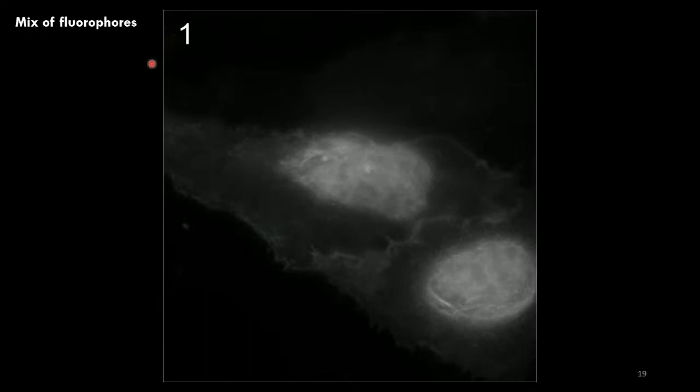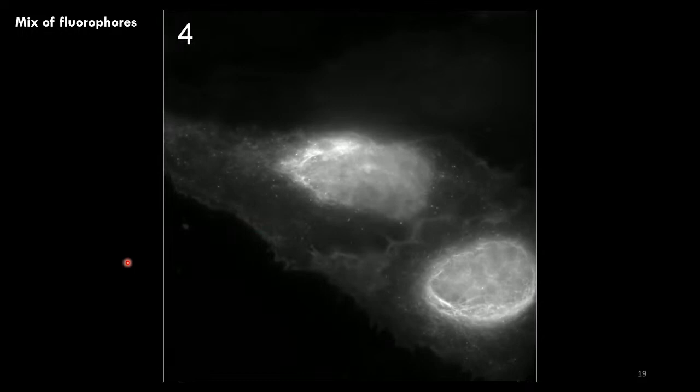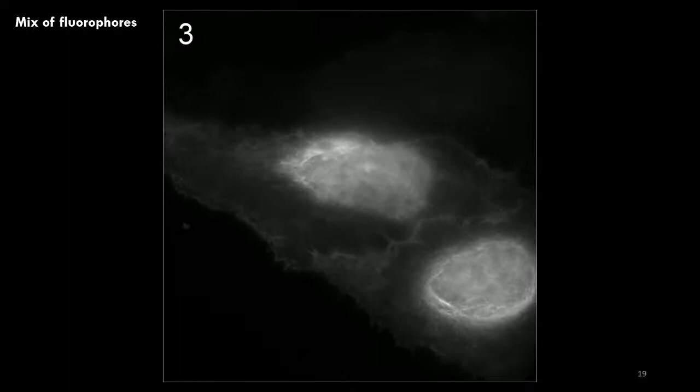But obviously, by eye, they're hard to really distinguish. So we applied our method to this mix of fluorophores within cells, and we analyzed them per pixel. The analysis per pixel actually gives an extension to NEMO. So it's extended NEMO, so we call it X-NEMO in the paper.